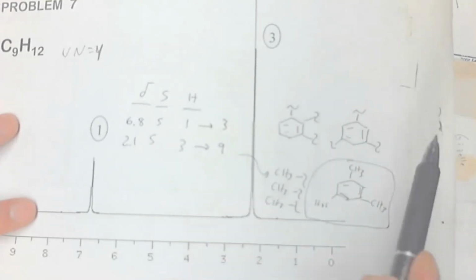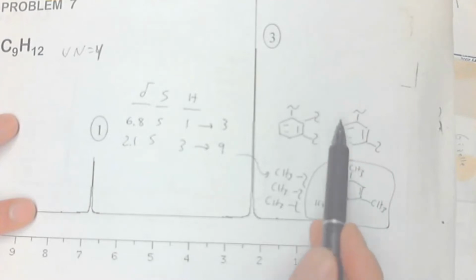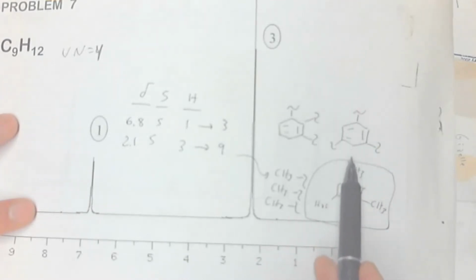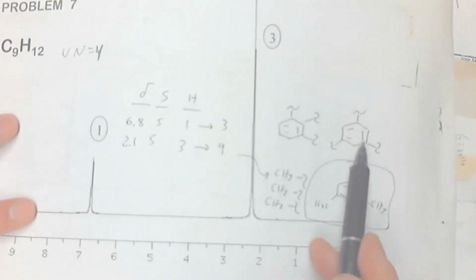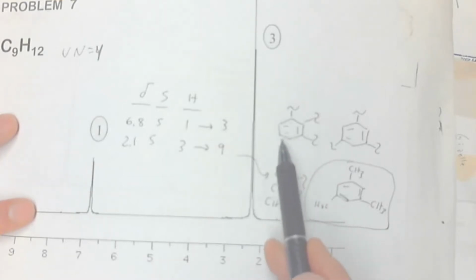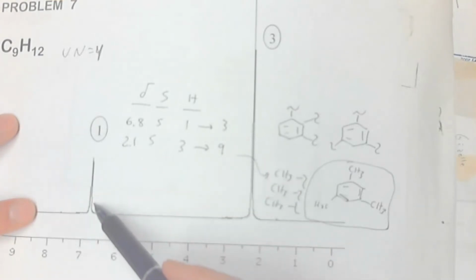And that would be the case if you had the squigglies equally distributed, because these would be identical, identical, identical, right? So somebody said on the left, would we get different splitting? And the answer is yes. This would be weird because these 2 are the same and that's different. So it wouldn't be as simple as this, right?